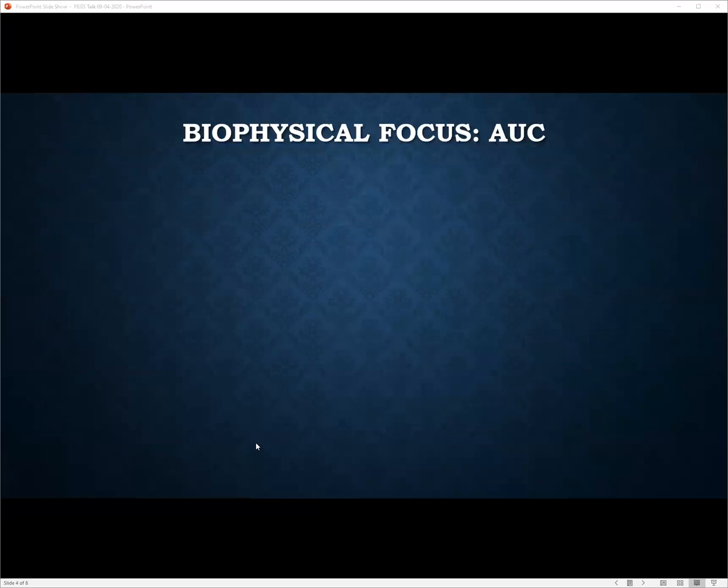So for the remainder of this talk, I'm going to talk about AUC. Specifically, it is a gold standard for particle characterization. All of the techniques that I mentioned before come back to AUC as their proving ground. They compare themselves to AUC, so why not just use the gold standard at all times? Now, AUC has been around for over 98 years and has been proven out throughout time. Right now it has played a prominent role in the gene therapy field. The FDA has seen it, the EMEA has seen it, and it's one of these critical parameters, for example, your percent empties, is being determined by AUC.